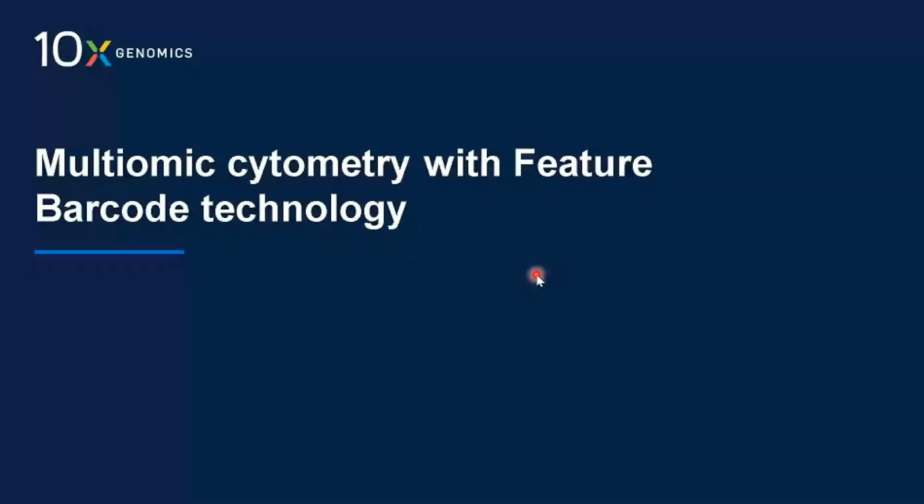The last sharing topic of today will be looking at multiomic cytometry with feature barcode technologies. In single cell technology, a lot of times we are looking at just the gene expression profile. In multiomic, we are able to compare the gene expression data to, let's say, the protein markers by using antibody binding, or even the study of the epigenetic condition of the DNA.